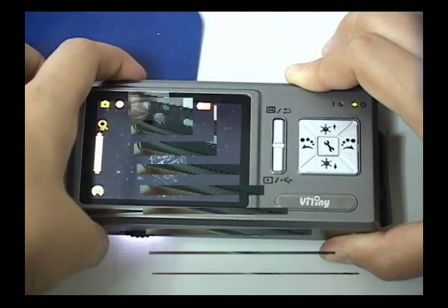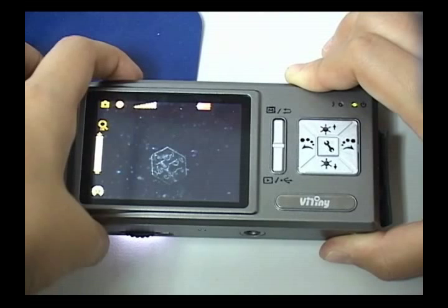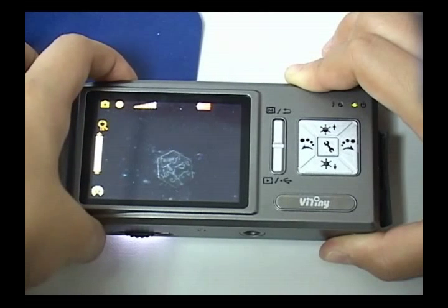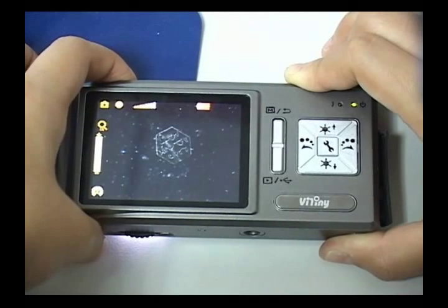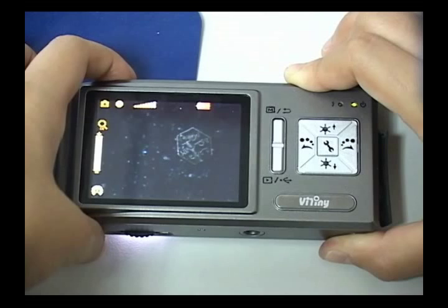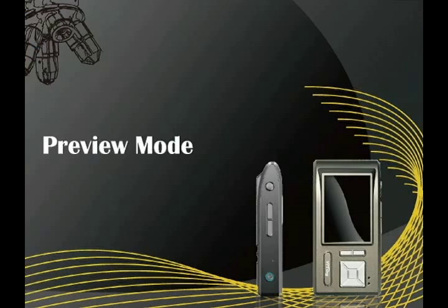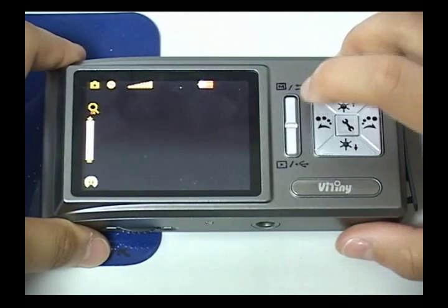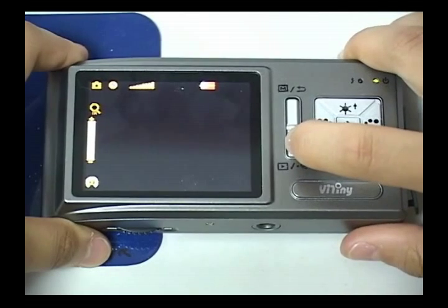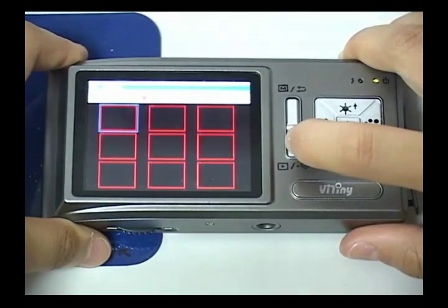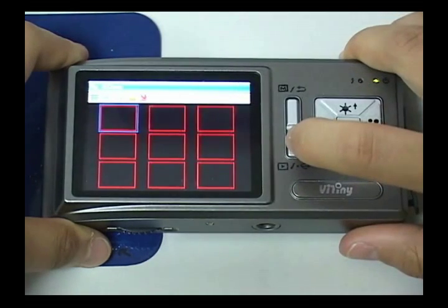Press Capture button to capture objects into image. Press Preview button to preview captured image.